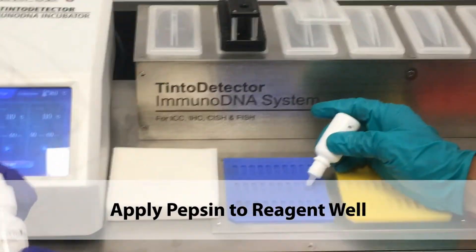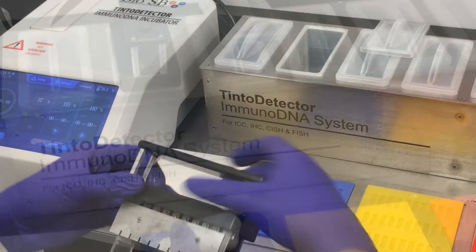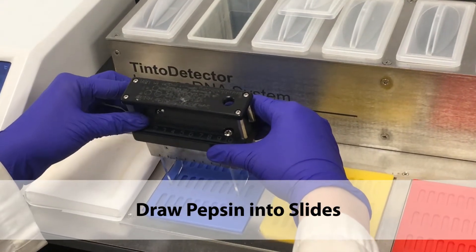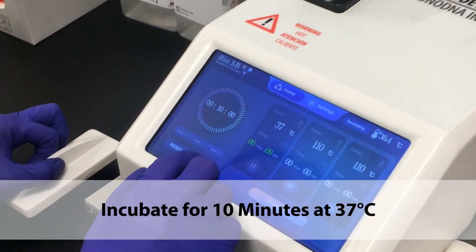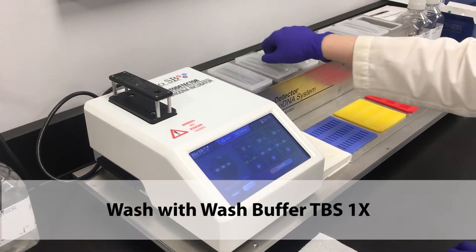Let the slides rest while you apply pepsin to the reagent well. Draw the pepsin into the slides and incubate for 10 minutes at 37 degrees Celsius. Wash with wash buffer.